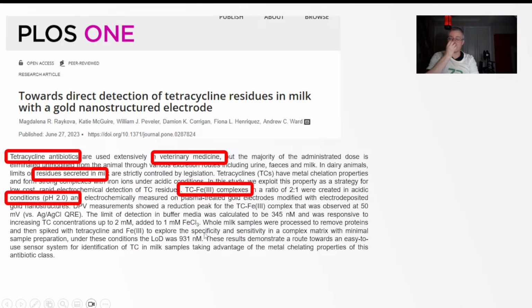They actually interrogate it at a low pH, which is really cool because, in fact, that is definitely a strategy that at ZP we use quite a lot of. So, in fact, when I do the test tonight, we will also be testing at a low pH. They were using differential pulse voltammetry, with a very sensitized gold electrode. I mean, the gold they use is sputtered, and it's also got electroplated gold on it as well.